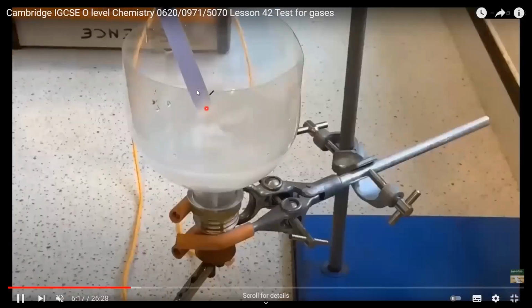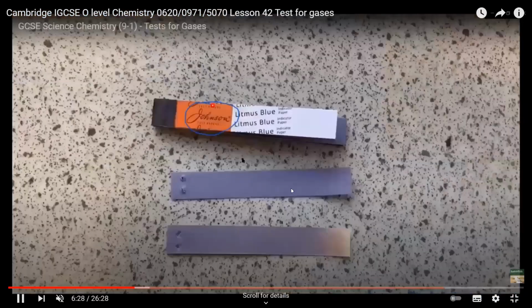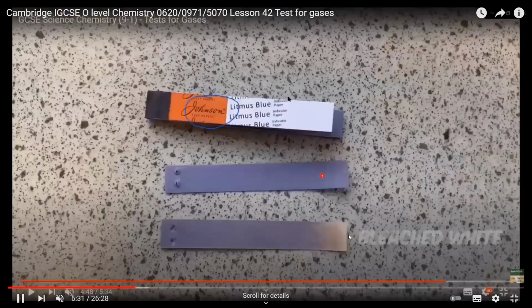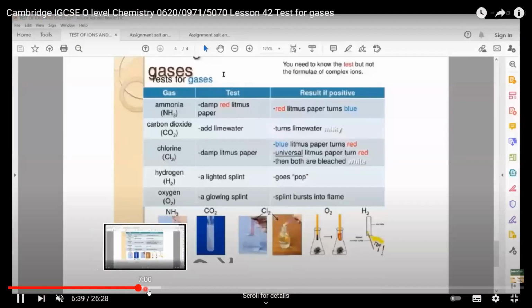First the litmus paper will turn red and then it bleaches. As you can see, first it turned red, and with the passage of time the litmus paper will bleach. It was blue, then it turned red, and bleach means the color is removed. So this confirms the presence of chlorine gas.